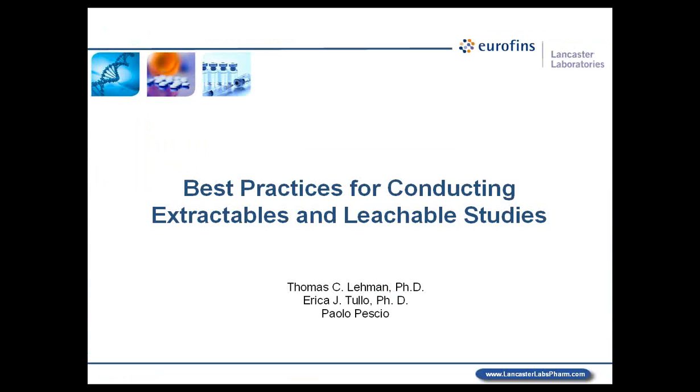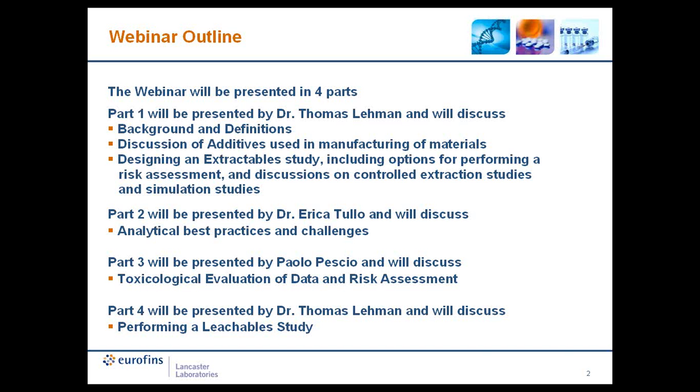Thank you, Andrew. First off, I would like to welcome all of our attendees to the webinar and thank you for joining us today. The webinar will be presented in 4 parts. I will be presenting part 1 and will be providing background information and definitions on extractables and leachables. I will also discuss how to go about designing an extractable study and what factors need to be considered in the design of a study.